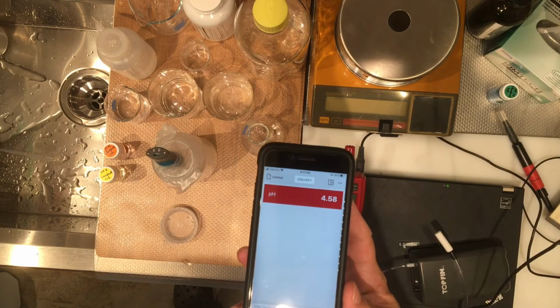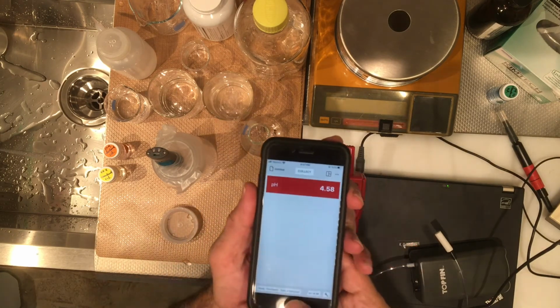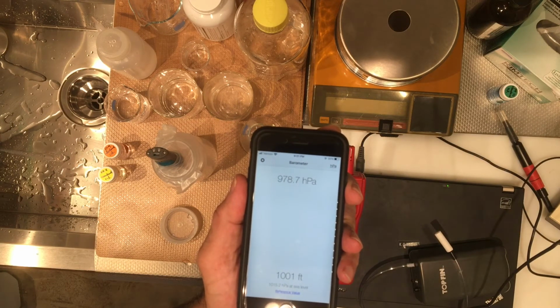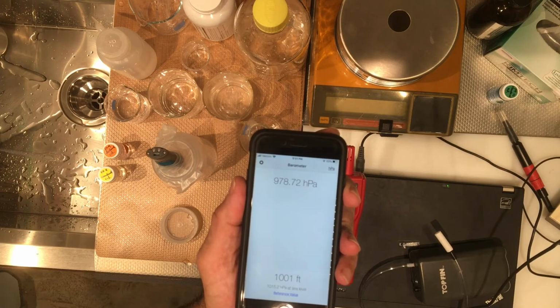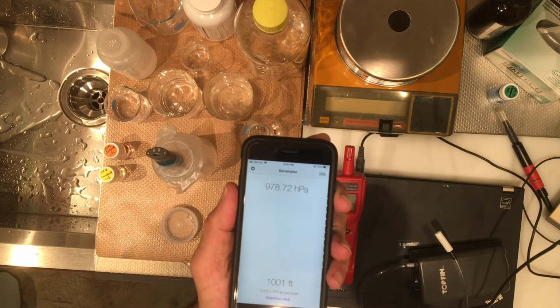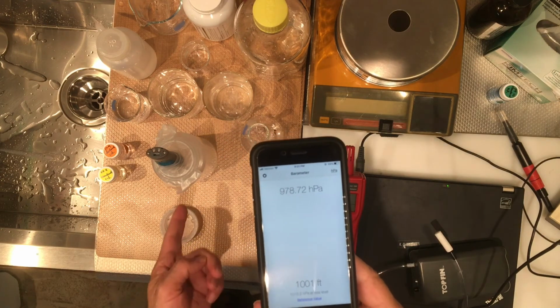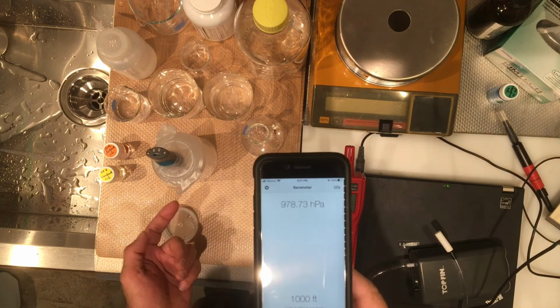So record this pH, and the pressure in the room right now, I'll show you the pressure. So it's 978.69 or 71 hectopascal. So work with this pressure, what you see, 978.72 now, and then work through the calculation and calculate the parts per million of the carbon dioxide and the percentage of carbon dioxide that's inside in the gas.